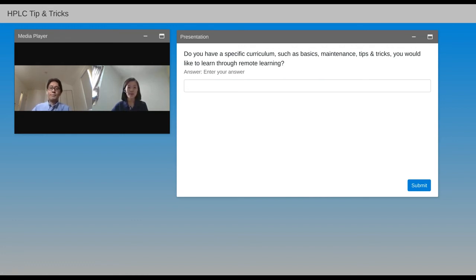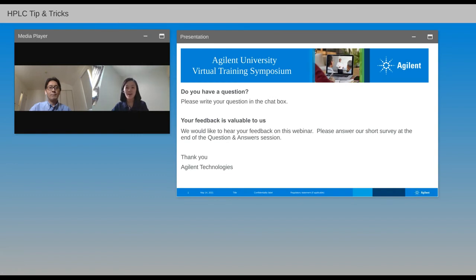You need to make sure that your sample preparation is adequate to the HPLC. And you also must make sure that you use HPLC grade water. Always filter your solvents before you use them. And one thing that you must consider is the miscibility of the solvents. Especially if you are using salt buffer, you need to ensure that the salt mixes well in your water, and also when the solvent and water are mixed together during your gradient run, at any percentage concentration, the salt will still be miscible in the solvent itself.